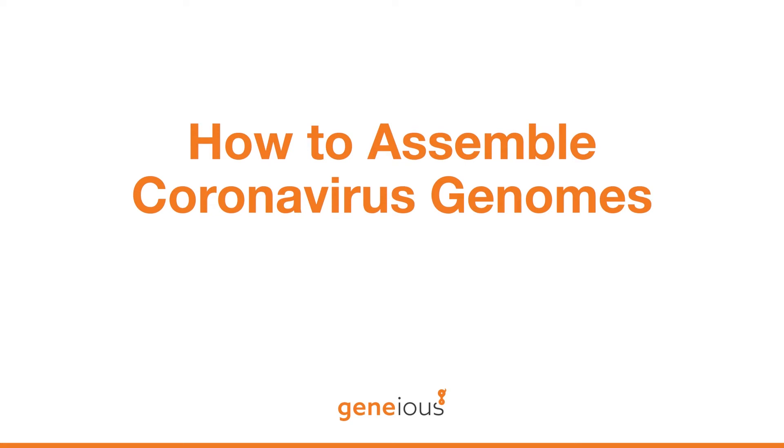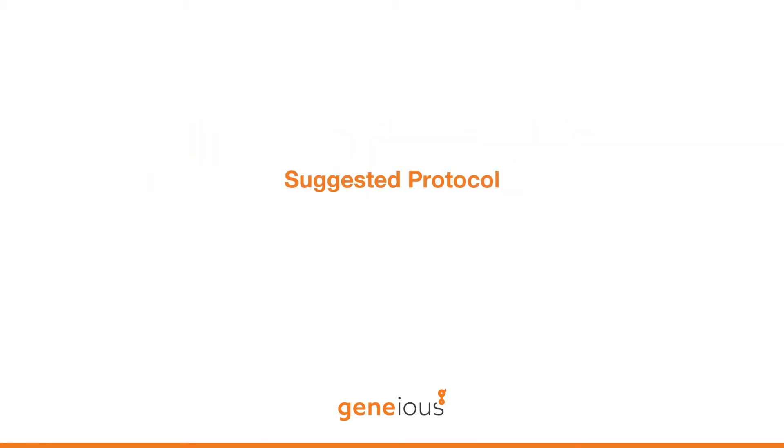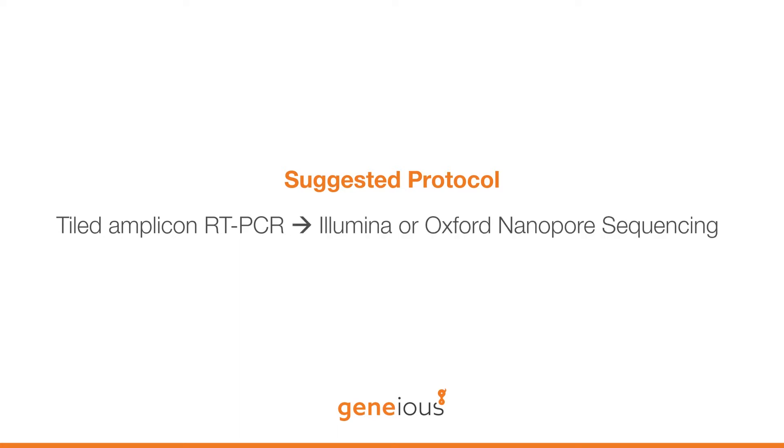In this video, we will review the assembly of SARS-CoV-2 genomes. The most popular method for generating SARS-CoV-2 whole genome sequences is tiled amplicon RT-PCR, followed by sequencing with Illumina or Oxford Nanopore technology.